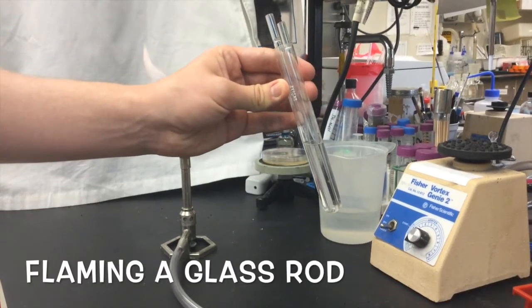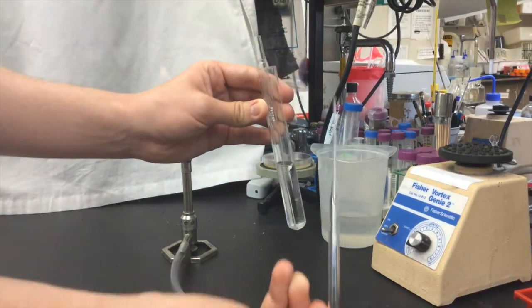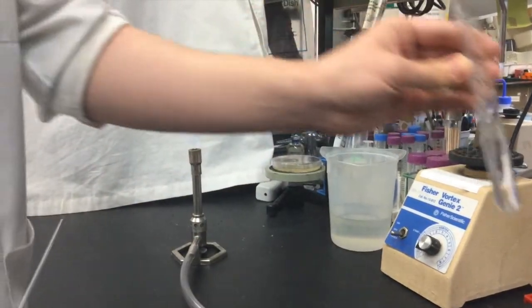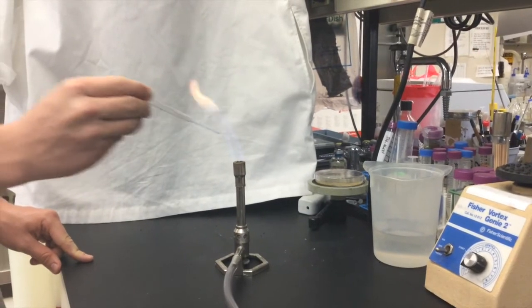Alternatively, it is sometimes faster to use a glass rod as an inoculating loop. I store the glass rod in 90% ethanol and flame it in the Bunsen burner just before I use it to transfer cells to liquid or streak an agar plate.